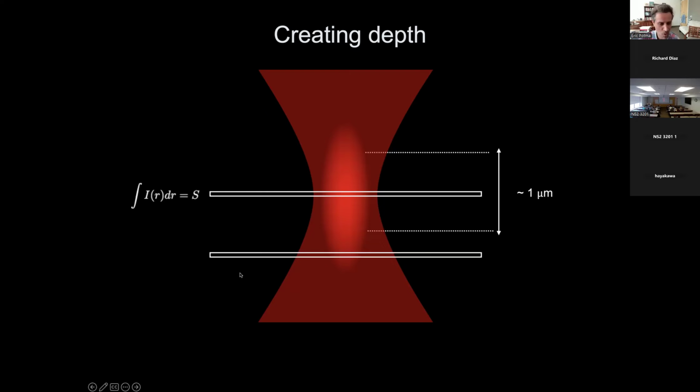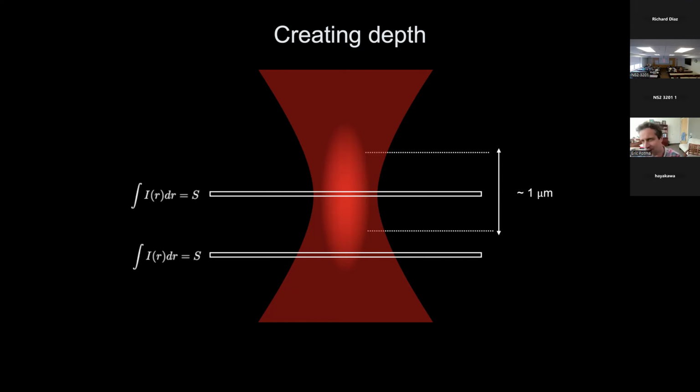What I'm doing here is I'm integrating the light in this entire plane. It still adds. Why is that? Because the light basically has to travel from below through the middle. It doesn't matter if you compress it a little bit. The total is still the same. It's just a light flux through the whole thing.